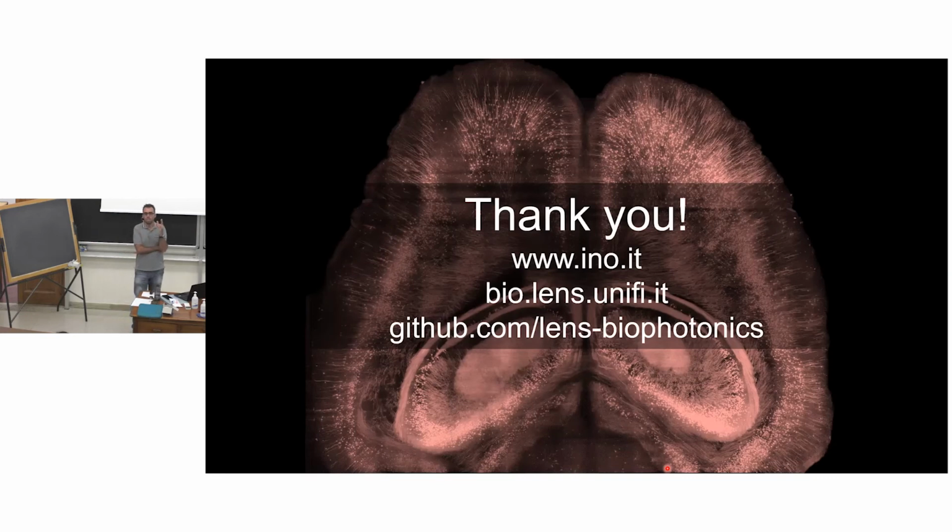There are other studies that have more of an anatomical goal, like the ones that we do for the NIH, the National Institutes of Health, the big study of the human cortex. Those are mostly more technological than scientific at this moment. They are a technological challenge more than a scientific one. It's the equivalent of the genome mapping. At the beginning, mapping the genome was just a technological challenge. Then, of course, it developed into a field. Now, mapping the connectomics in the whole human brain is, first of all, a technological challenge, and then it will, for sure, deliver some scientific results. So we are at this stage for the moment.